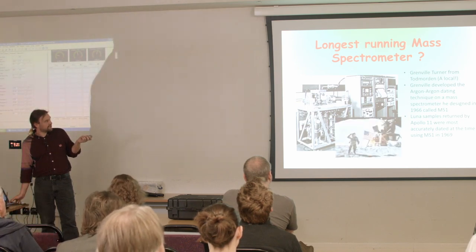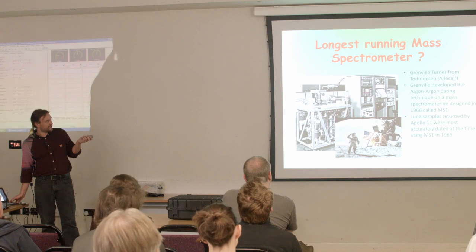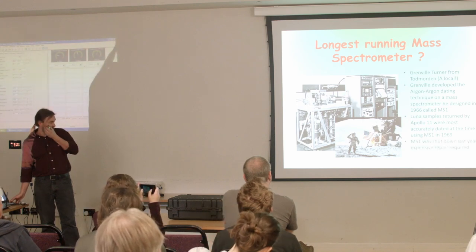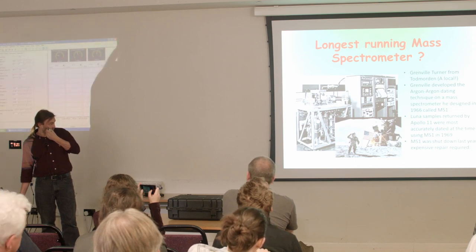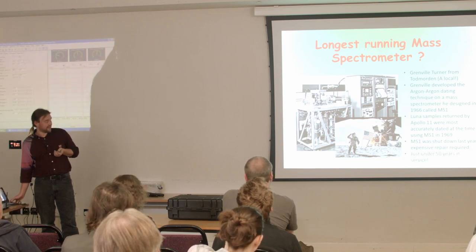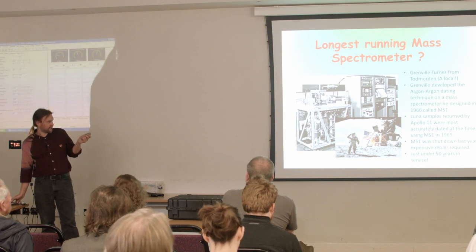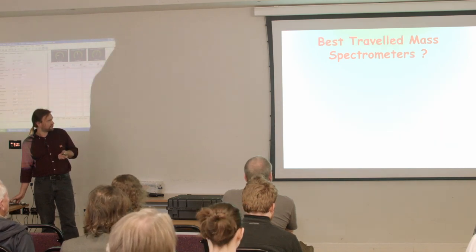And this mass spectrometer, well, he built it in Sheffield, then he moved to Manchester. I've seen it up and running. Unfortunately, it's not running at the moment, but it was running for about 50 years, which is, I think, a world record. I've asked people around the world about this, and I think it is the longest running mass spectrometer.